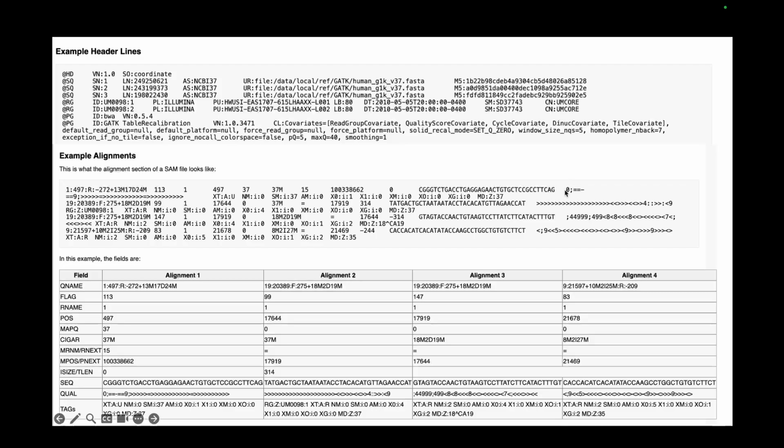If you see, it starts from this 0 and ends at this greater than sign. This is also ASCII coded. This is actually representing the quality score for each base using ASCII characters. If you converted it into numbers, it'll actually be like 20, 30, 40, something like that, which are the Phred scale quality scores, as we discussed. So this is how the header looks.